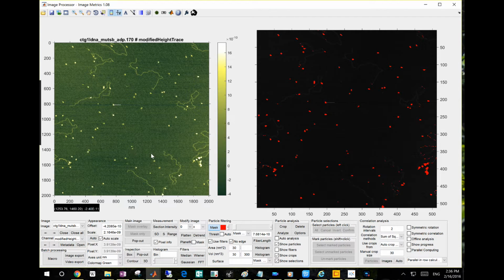You can use a mask flattening. Right now on the right you see that specific area is masked. What you do is you check the mask box, which means the area of this specific high region is excluded in the flattening procedure. Once it's excluded, the flattening will take care of the dark lines, so they should be flattened well. We don't really care about that particle, so we can leave it as an outlier. I'm going to do a zero order flatten again, but this time with the mask. I'll check the mask box here. Yeah, sorry, let's do it.